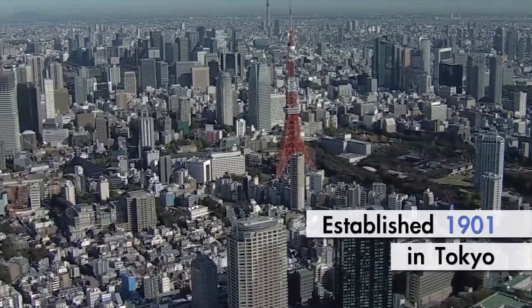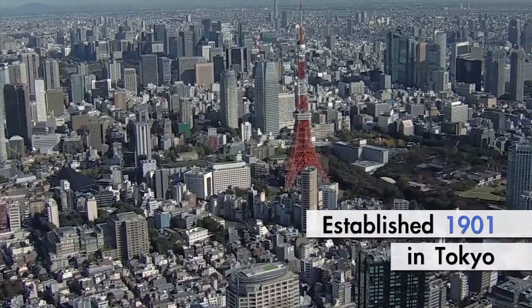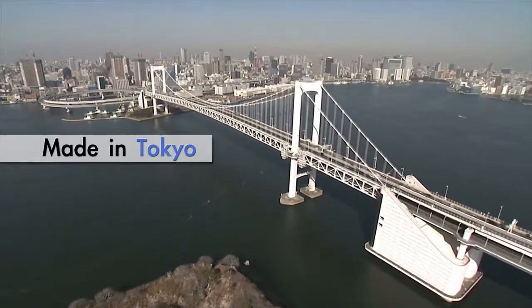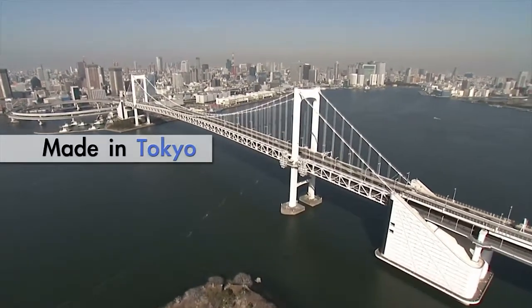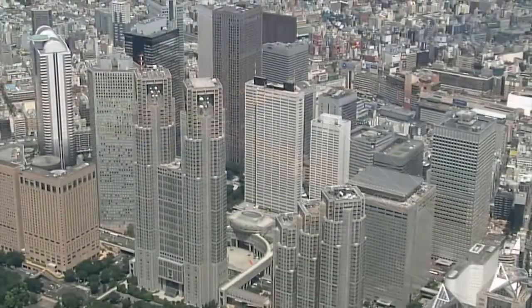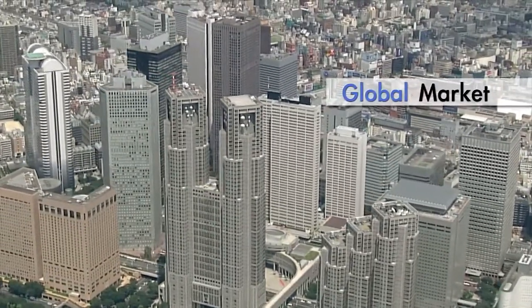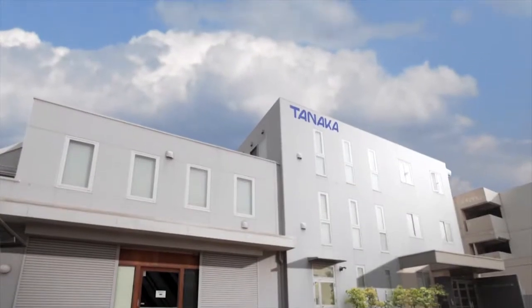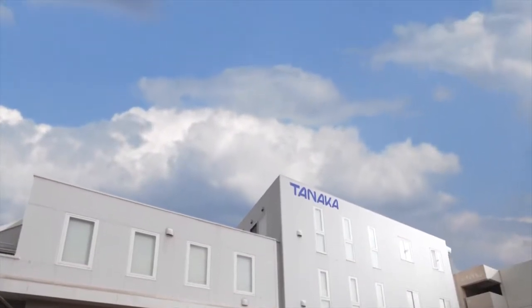Tanaka Scientific was established here in Tokyo in 1901. Since the early 1900s, Tanaka has been supplying petroleum testers to Japanese customers, and since the 1970s, to the global market. And the demand has been increasing year after year.